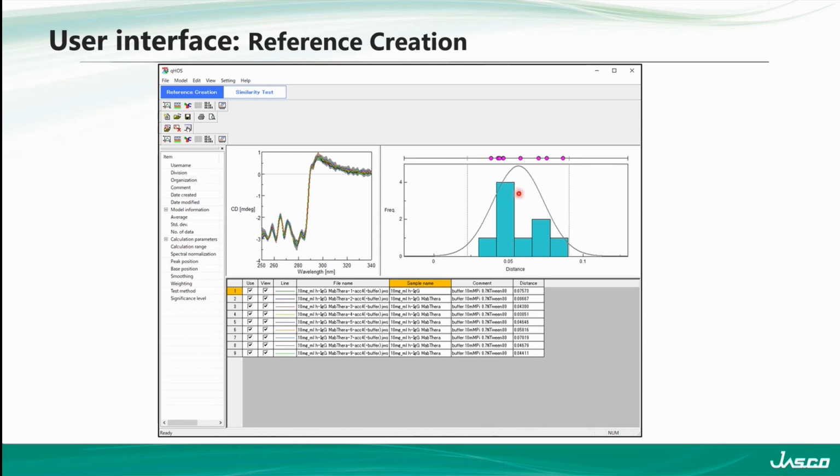And so if we thought maybe we want a little bit more consistent frequency, we could run further references in order to shift this box towards the middle. Or we could say we're sort of fine with this type of deviation. It's not too high, and we could use this as our reference data set.